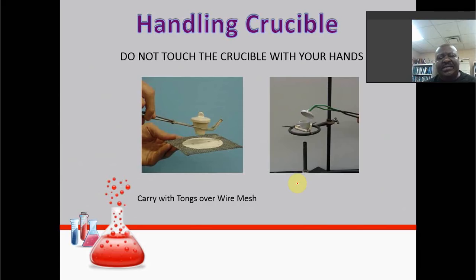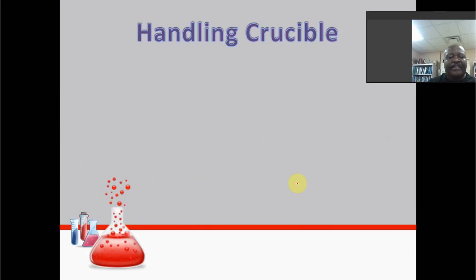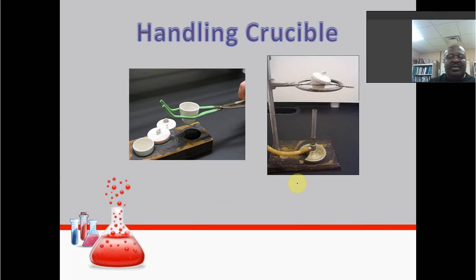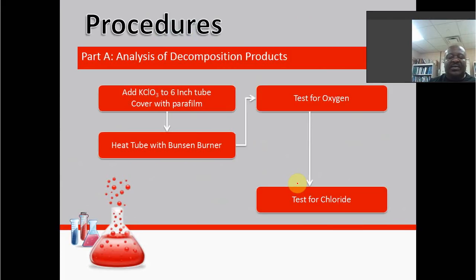So that's the setup. Hot is hot, so handle the crucibles that way by using the tongs. So that's what we're doing in lab today.